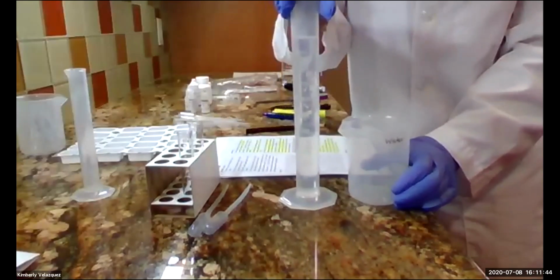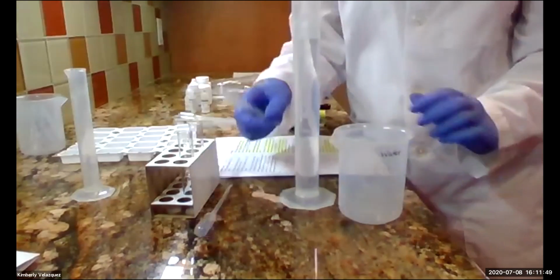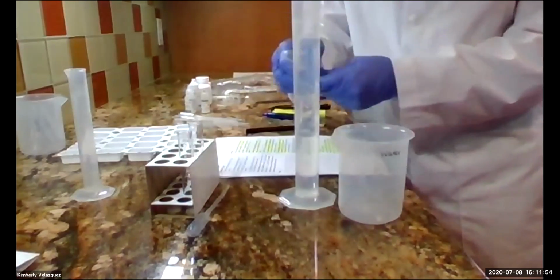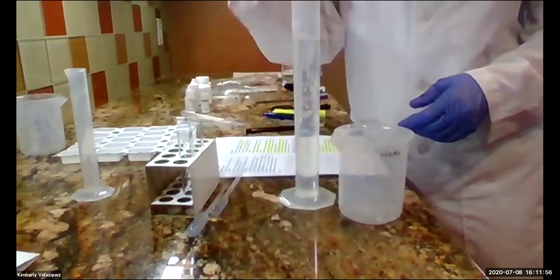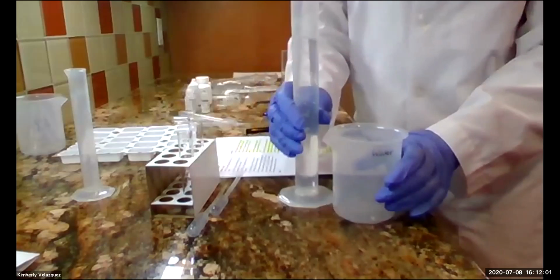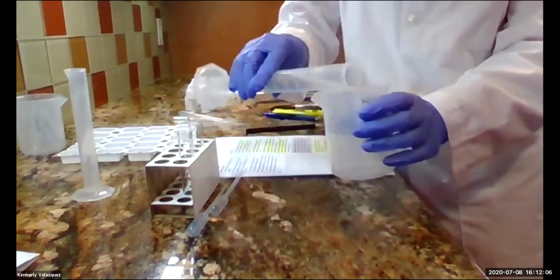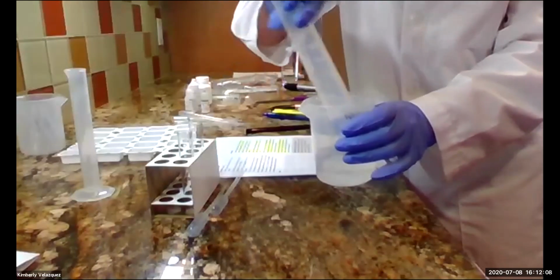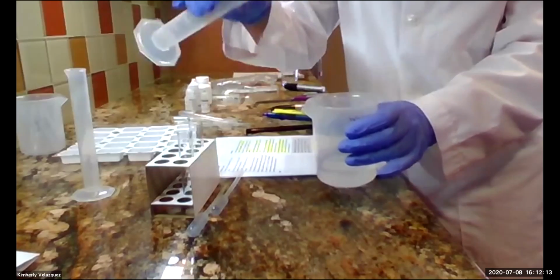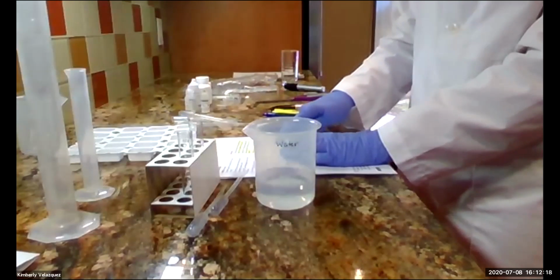So I used my 100 mil graduated cylinder, and I actually got it precise because I don't like to do anything approximately. To get things precise, you would want to use the one that says W for water, and either add or subtract water until you get right to the 100 mils. You always want to measure with the graduated cylinder, it's more precise, and then pour it into the beaker. The beaker is a good vessel for storing things and for doing an experiment. It's not good for accurate measurement. Okay, so now I have my 100 mils of water.